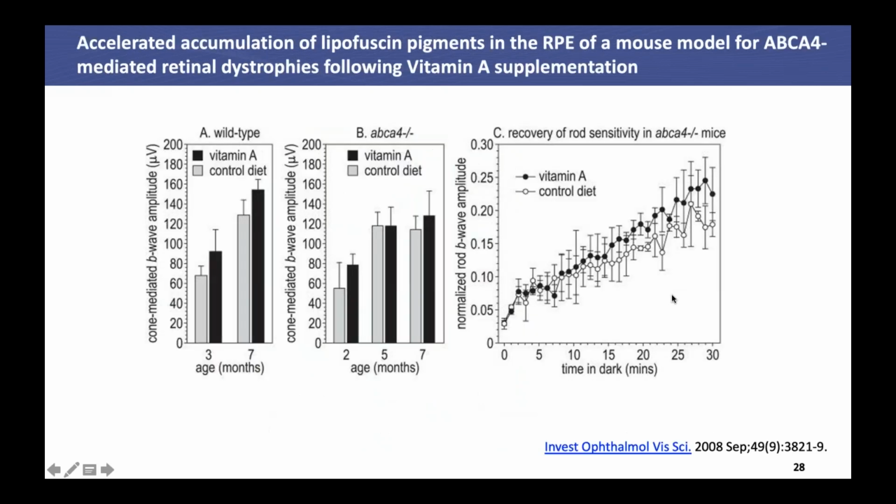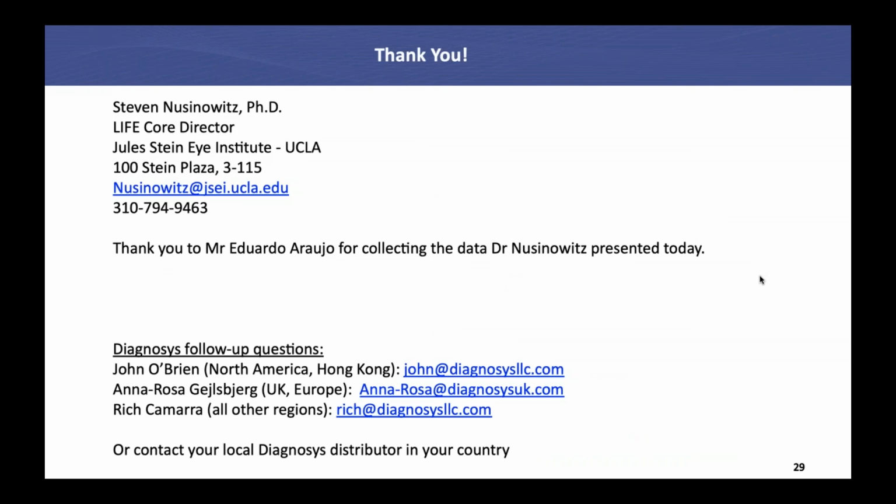And you can go the opposite direction and ask what happens if, instead of restricting vitamin A, which is what you're doing with vitamin A inhibitors, you enhance vitamin A supplementation and provide more vitamin A. You can see the opposite happens. It's plotted upside down, but basically recovery with vitamin A supplementation is increasing relative to control. So I'm going to stop there because these are 3 projects that we're working on now.